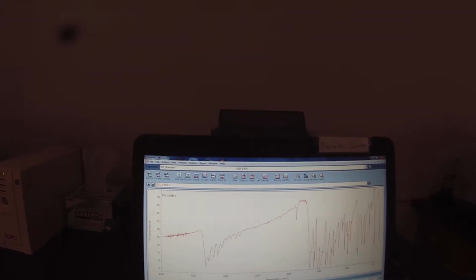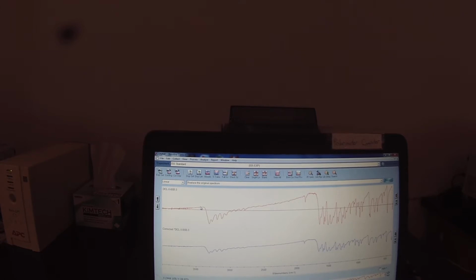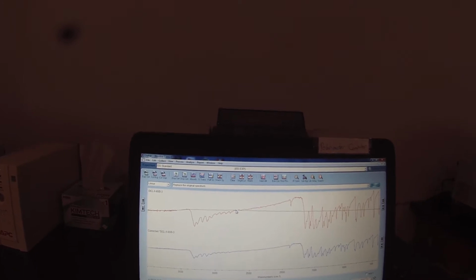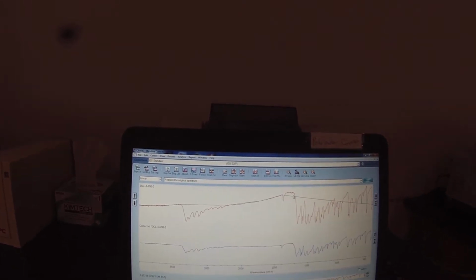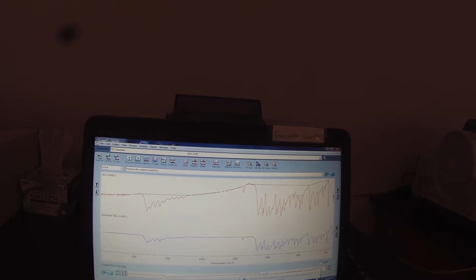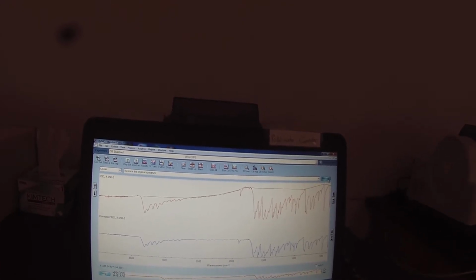And now I can do a baseline correction. That's all water, that chatter. This is all baseline here in the middle. That's probably pretty close to baseline in this one. Just bring that out. Good place. So that's a lot nicer looking.